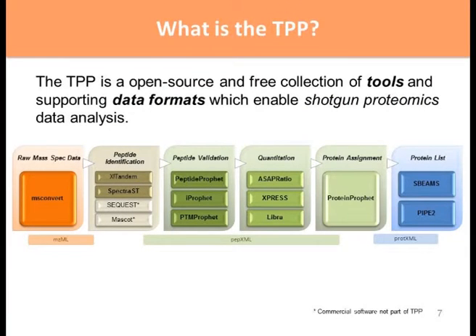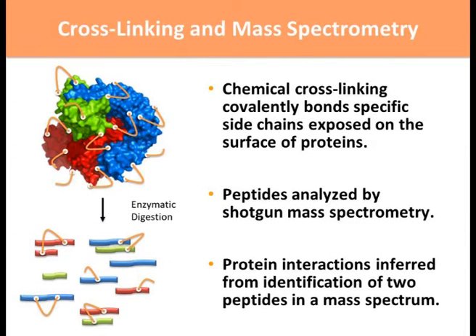And so at the moment, what we're going to talk about, so we've gone through the TPP process now where we know how to convert the data, we know how to use the algorithms that we're doing to analyze this data, what the benefits are of doing statistical analysis of what we have, and then we also have these programs that can go do this iteratively to get more out of your data. We've learned about the standard file formats that have underpinned all of the Atlas pipeline at the moment, but now we've got a couple of components that we're building, and we're also incorporating them as we go through. And so St. Peter will be the first one we talk about, and then Kojak is really what we're talking about this morning. And then we'll lead off into these other ones as the talks go through. And Mike will take you all through those.